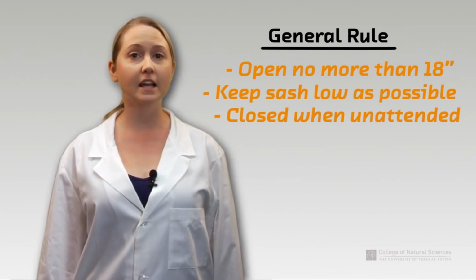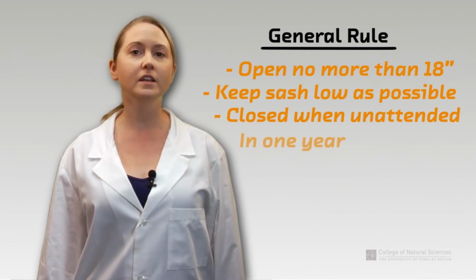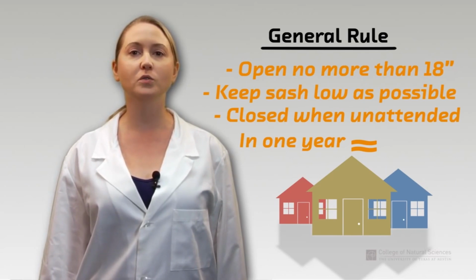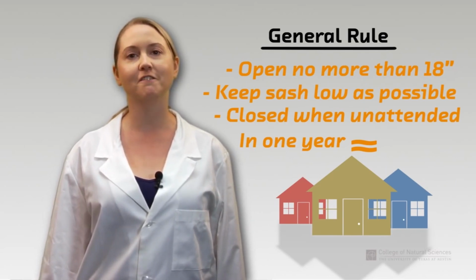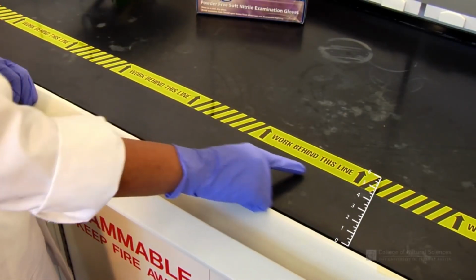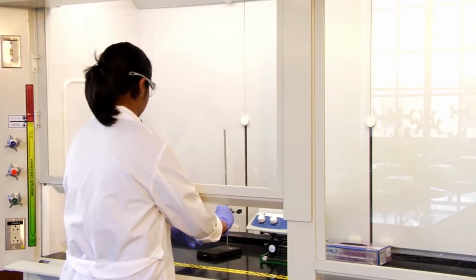A single standard fume hood open to 18 inches in 1 year uses about as much energy as it takes to power 3 homes. Keep the sash closed as often as possible for your safety and the good of the environment. Place materials you're using at least 6 inches behind the sash to minimize air turbulence, but don't lean too far in to perform work.